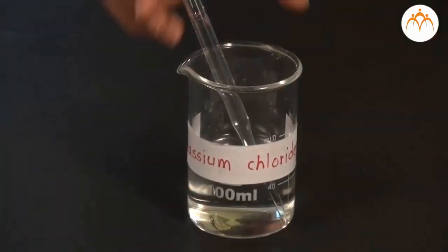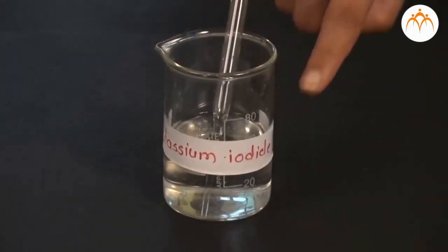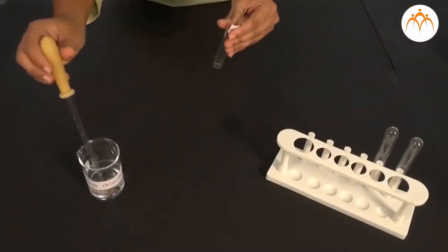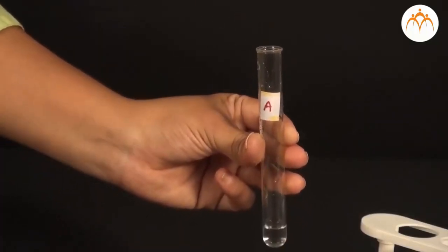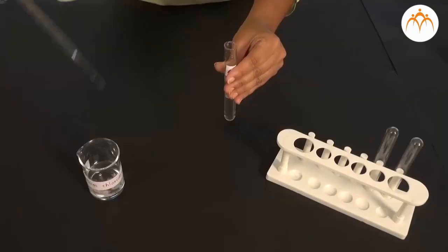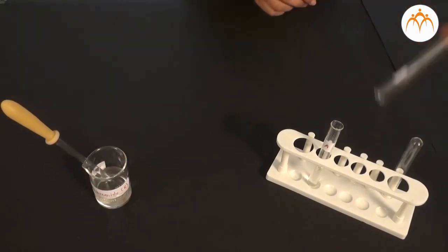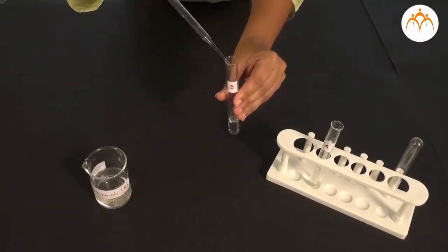Procedure. We keep solutions of potassium chloride, potassium bromide and potassium iodide in 3 test tubes and label them as A, B and C. Now we want to find out what they really contain. Which test tube contains chloride, which contains bromide and which contains iodide. We keep these test tubes A, B and C on the test tube stand and add a few drops of silver nitrate to these 3 test tubes.